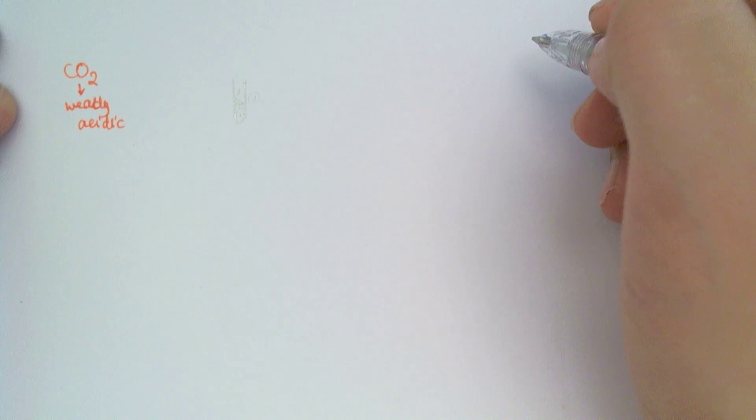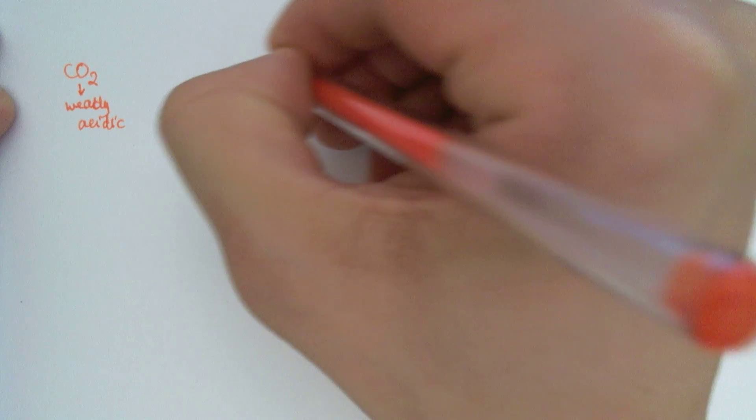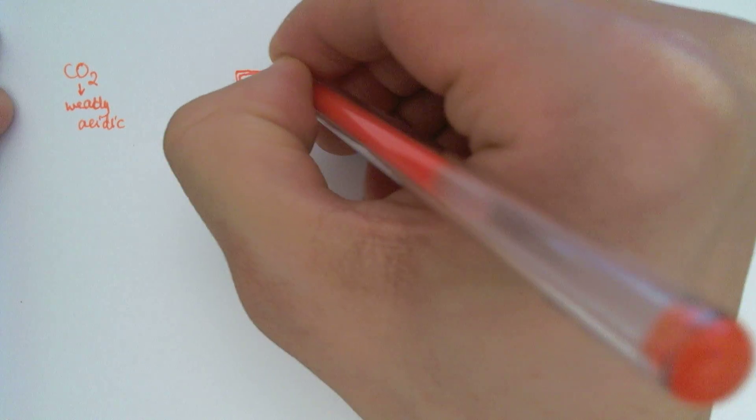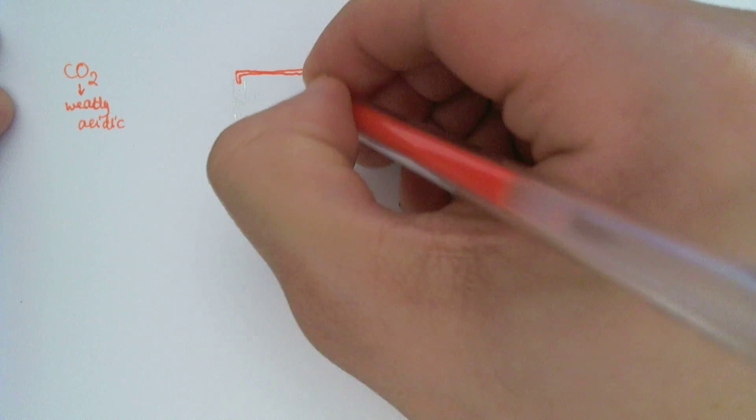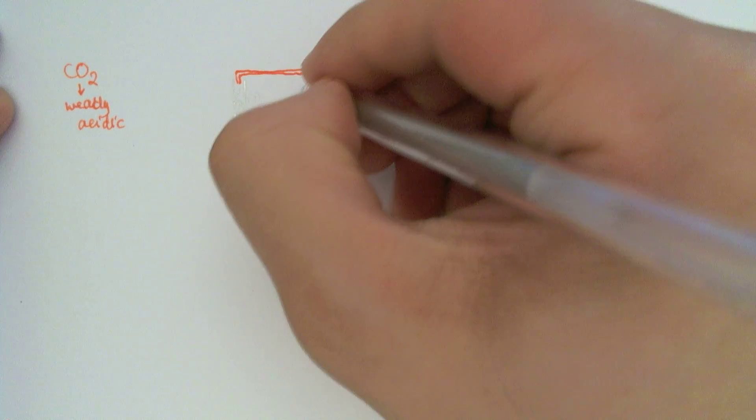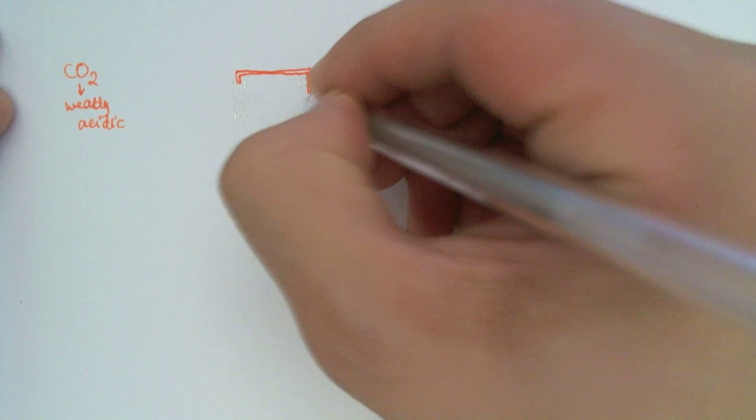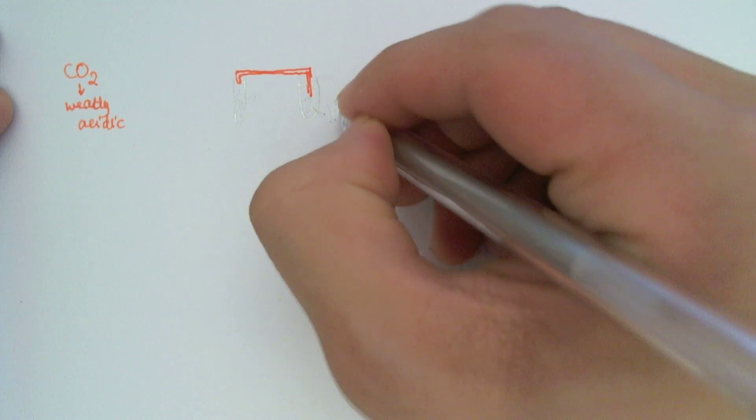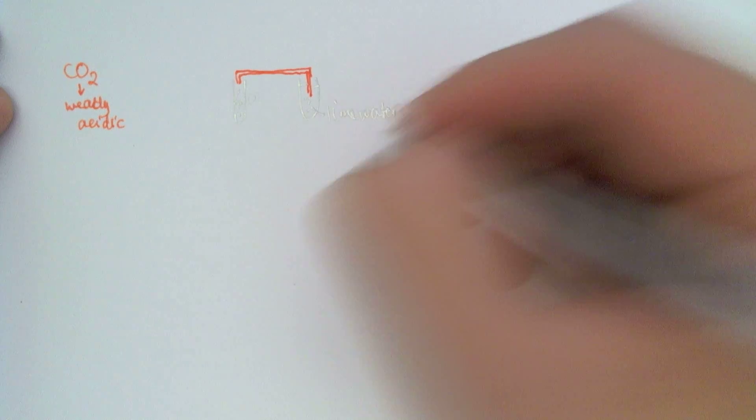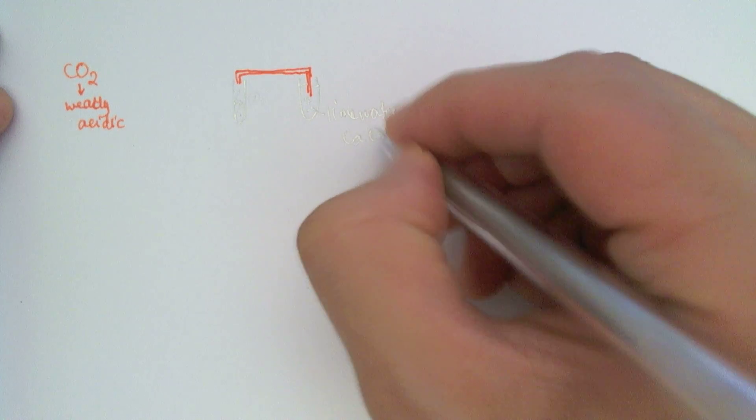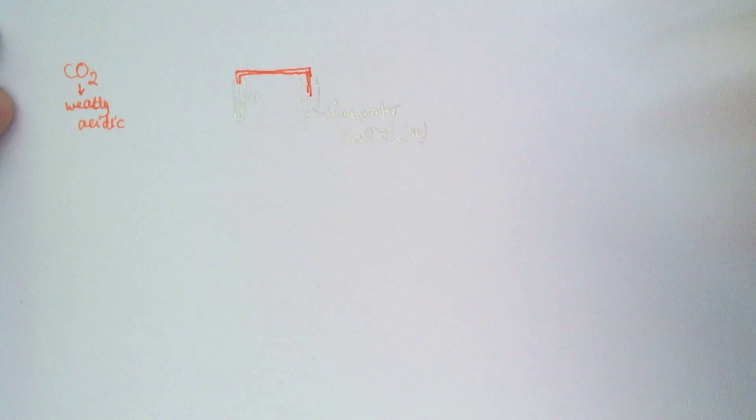And if some carbon dioxide is being released, we will take that carbon dioxide and channel it into a test tube filled with lime water. So we have some lime water in this test tube. And lime water is calcium hydroxide aqueous.